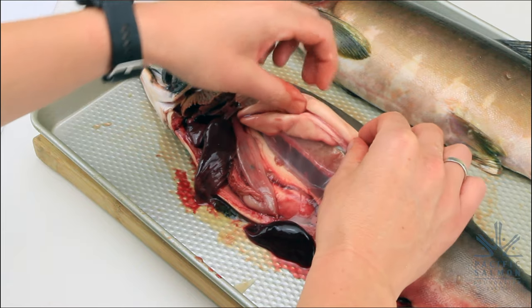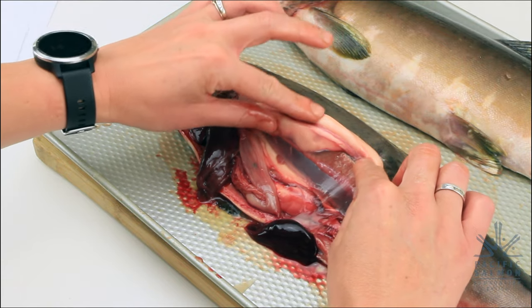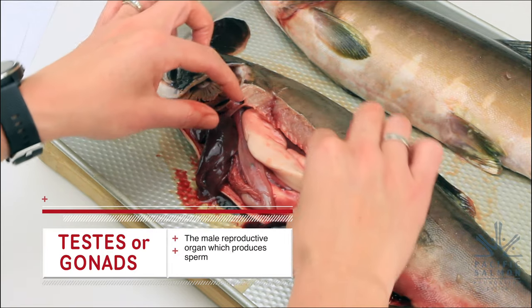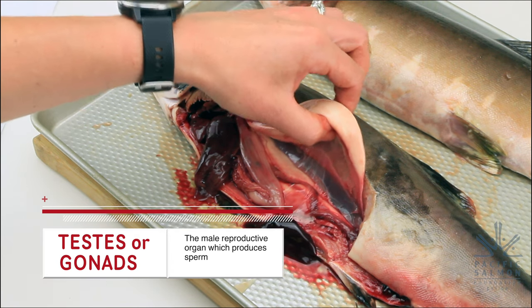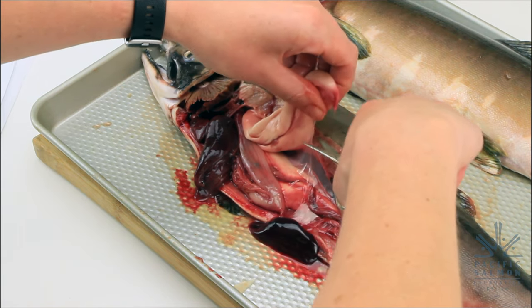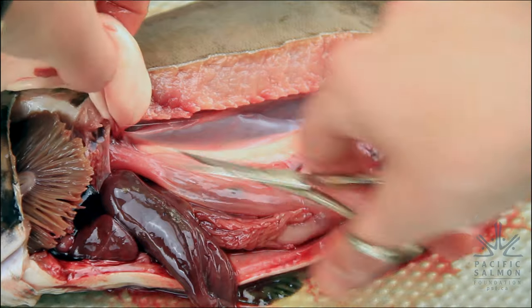Now, this fish was a male. These here are the male testes — this is where the male produces sperm. There are two of them, one gonad here and the other underneath. Now we've got the male gonads, or the testes. Cut out your testes and put them in the correct location inside your fish diagram.